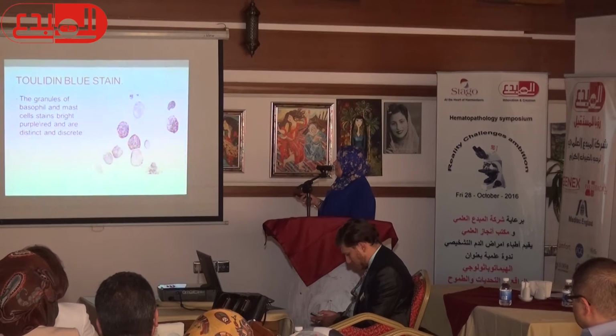This is a toluidine blue reaction. The granules of basophil and mast cell appear discrete and distinct.